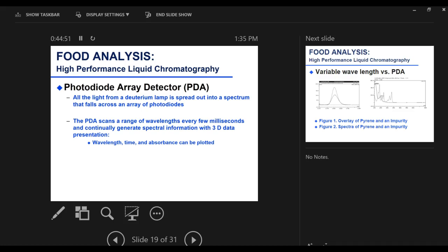For the caffeine, we got a lambda max of 272 nanometers. That means for the caffeine, we had maximum absorption at 272, and it absorbed from 250, I believe, up to 300. At 315, it did not absorb light. So that was the spectrum that most of you saw in the lab.